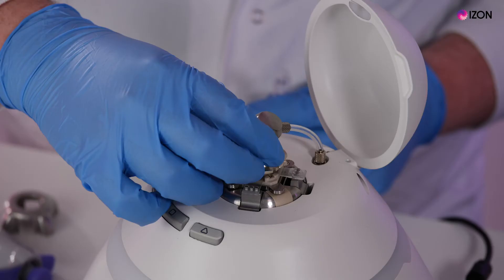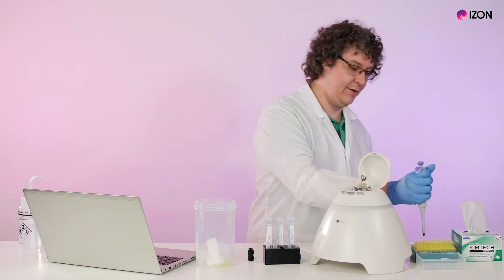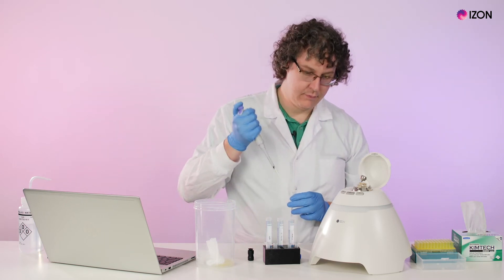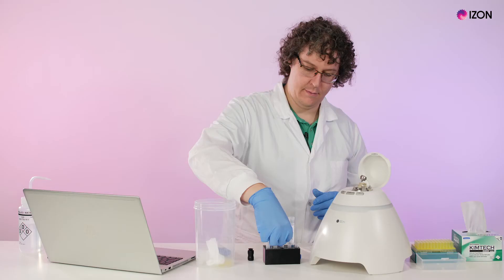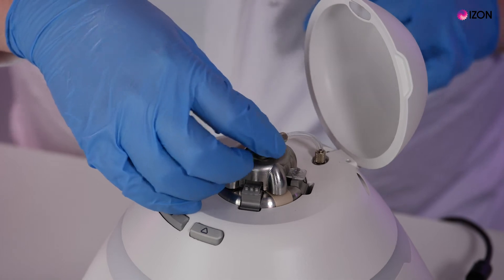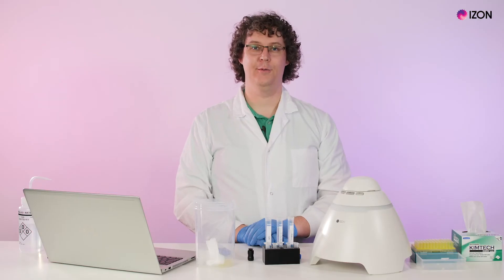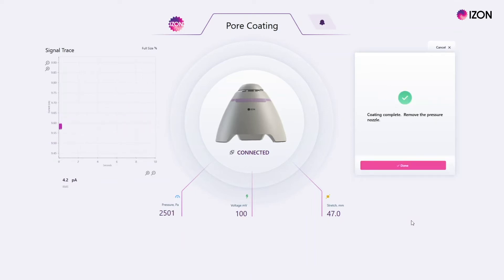Then attach the upper fluid cell and add 35 microliters of coating solution. Mount the shielding cap, insert the pressure nozzle, and close the lid. Wait for the coating process to complete — this will take approximately 10 minutes at the maximum pressure of 2500 pascals, which has been sped up for the purposes of this demonstration.